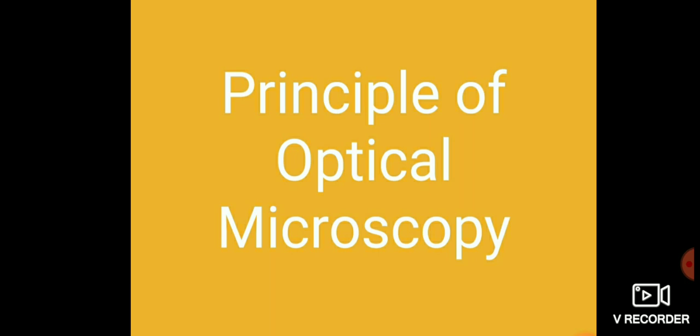An optical microscope creates a magnified image of an object with an objective lens, and magnifies the image further with an eyepiece to allow the user to observe it by the naked eyes. Of the many techniques available for the analysis of solid materials, perhaps the simplest is optical microscopy.